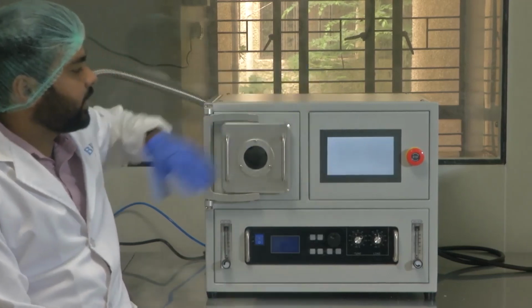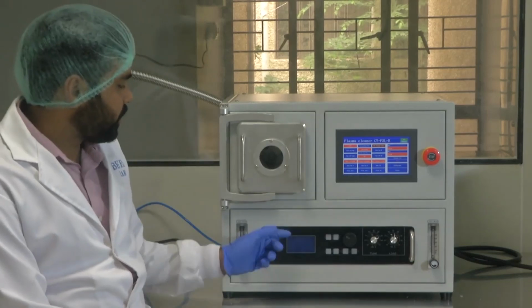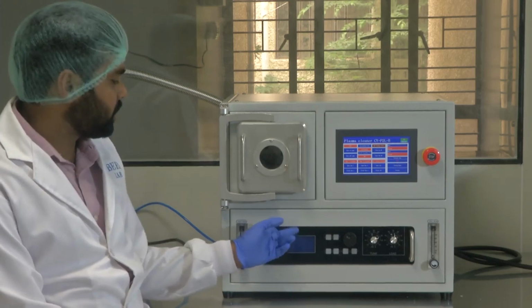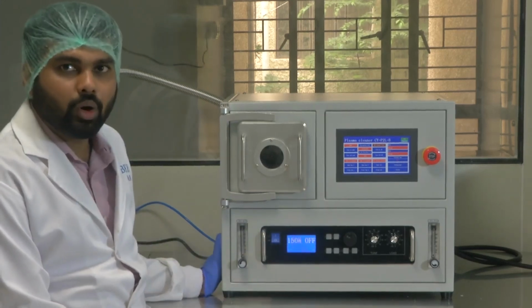Starting, and you will get the interface. Okay, now the interface is on. Now we need to switch on the plasma control also. So I am switching it on. You can see here the plasma control coming up.